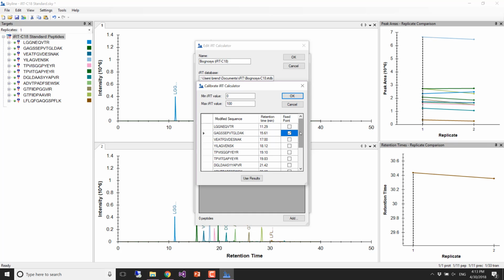At this point, there's no linear regression. We're just trying to define the distance, and then everything else is going to get calibrated from that. I don't know why they didn't do this. I would have preferred they didn't use 0. I would have preferred they did 10 to 100, so that very few peptides would ever get 0, because it's kind of problematic that retention time gets expressed in zeros and negative values.